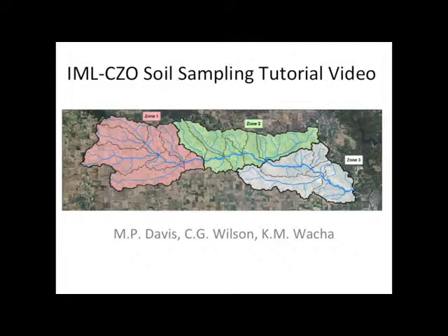In this video discussion, we will demonstrate the procedure for collecting soil samples that will be used for baseline measurements of soil organic matter in the IML-CZO. We will outline the necessary equipment as well as the steps involved to collect samples while avoiding cross-contamination. Finally, we will also present some general information for sampling safety within the field.